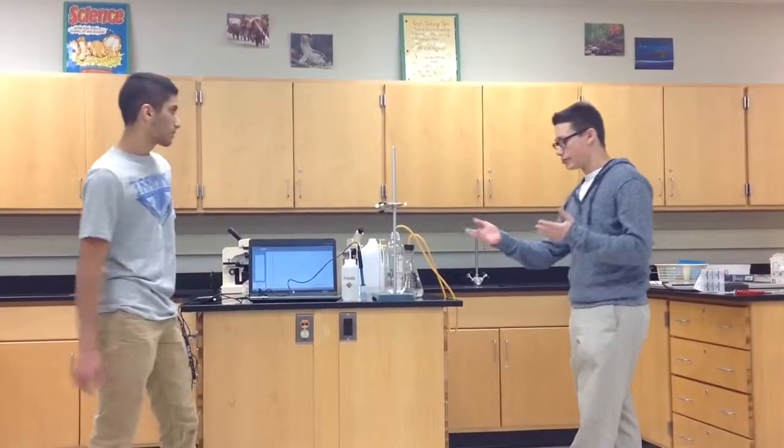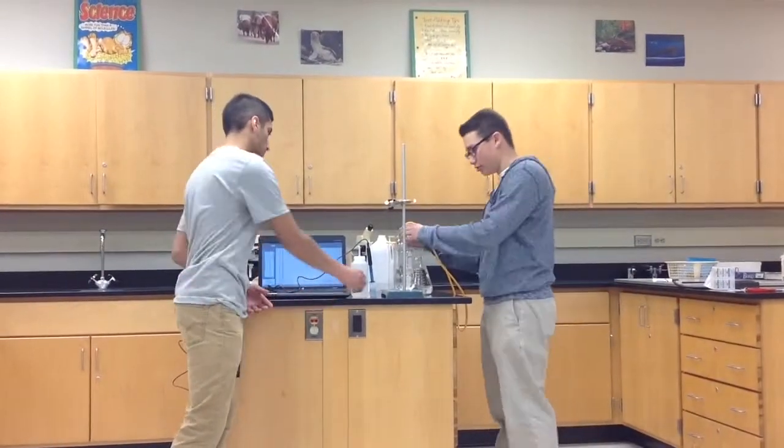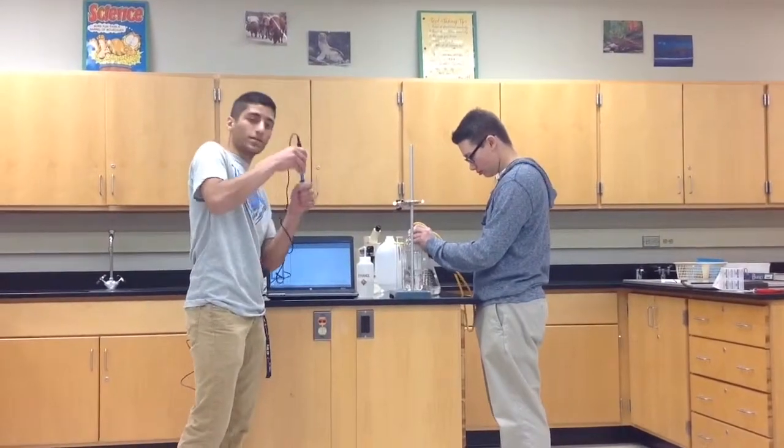So I will now measure the pH change of the water with the CO2. So I will remove the paraffin. And I'll get the pH meter out.